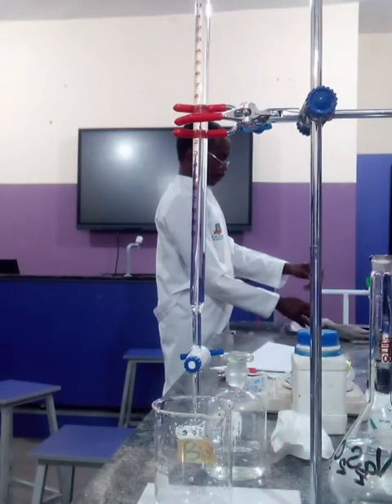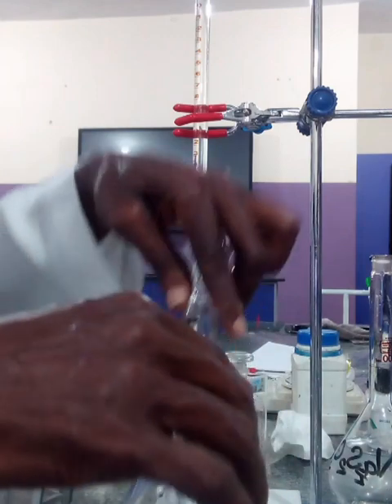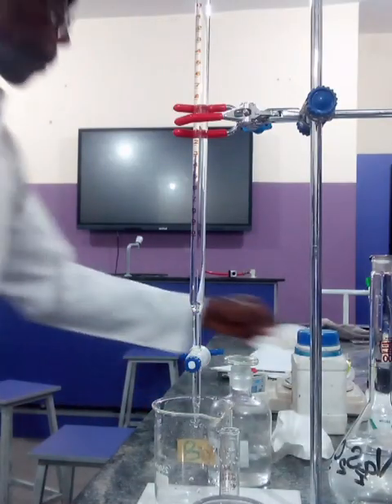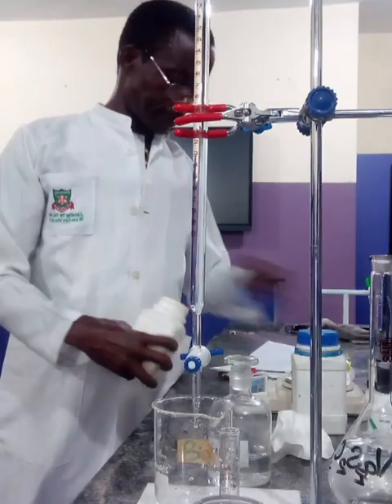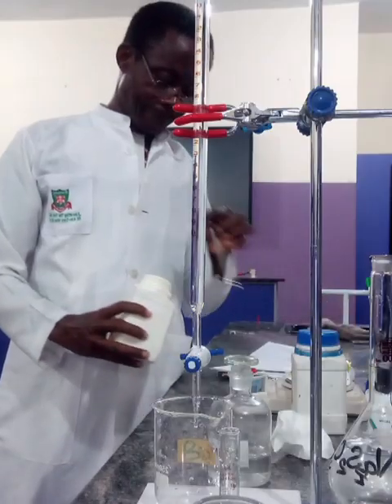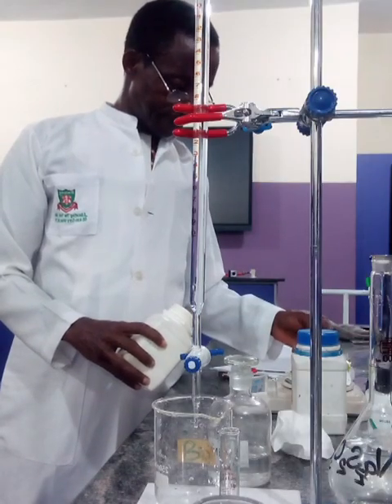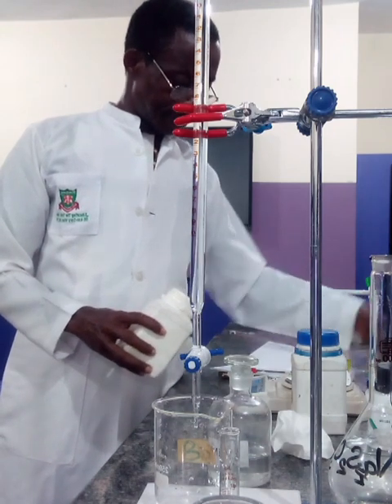After knowing the concentration, we find the mass concentration of the bleach, that's how many grams. The concentration of a commercial bleach is expressed in percentage weight to volume. That is the mass of the sodium hypochlorite that is present in 100 cm3 of the bleach solution.